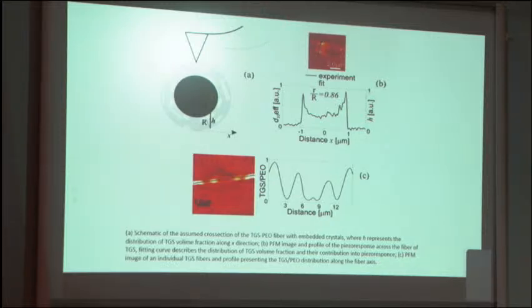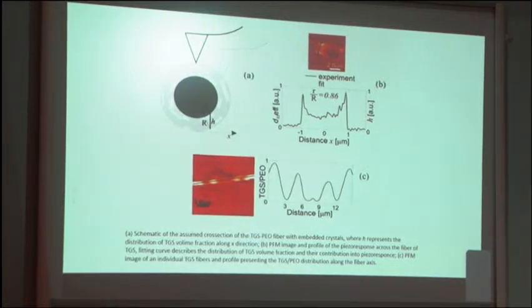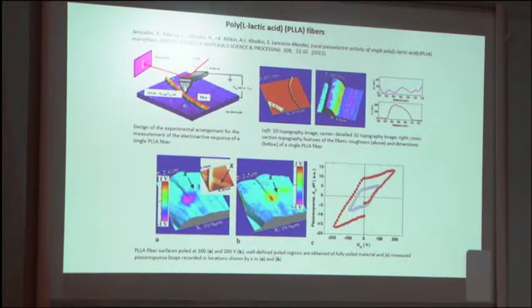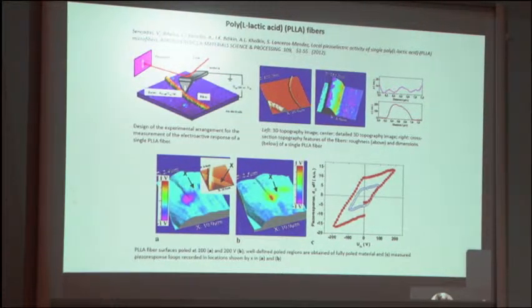And if piezoelectric particles or a non-piezoelectric matrix are distributed, we can see the distribution of particles corresponding to the size or the microstructure of these fibers. This is another example of fibers.